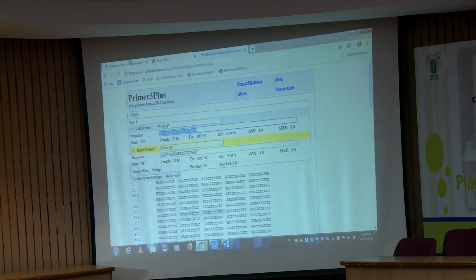No, you can do it manually also. Let us suppose you did the blast for your particular sequence, right. So, around 10-15 sequences you picked from the blast hit table, and you download those sequences. Now, when you are multiple aligning those, you will pick the region which is actually similar among all, okay, and then you can design the primer.